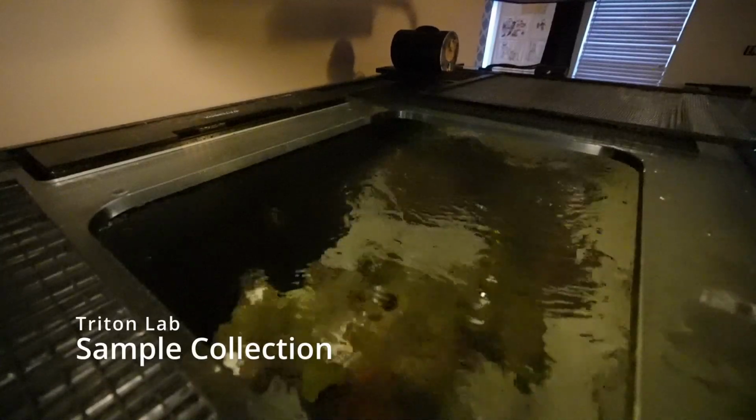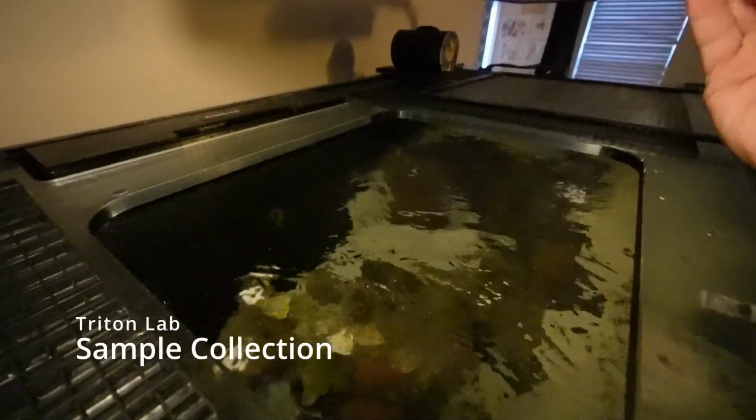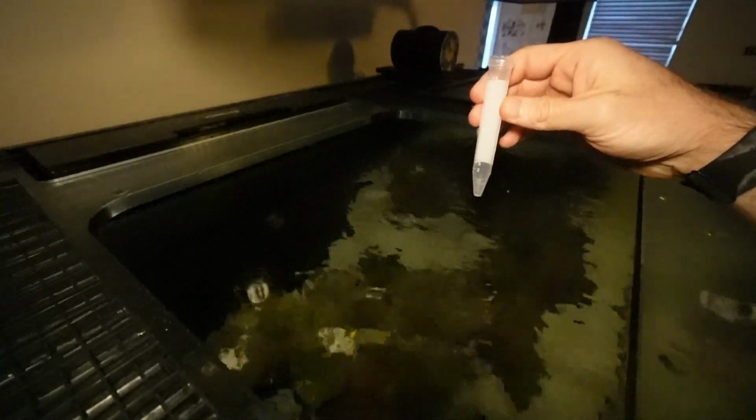All right, we are ready to collect our samples. So when I was reviewing the instructions, my original research had told me that 2 of these vials were used to collect your water sample from your reef aquarium, whereas the 3rd one was used to collect your RO sample. Reviewing the instructions with my kit, this one actually uses all 3 for the water sample and doesn't test your RO water at all. So we're gonna go ahead and get these prepared. I just wanted to point that out.